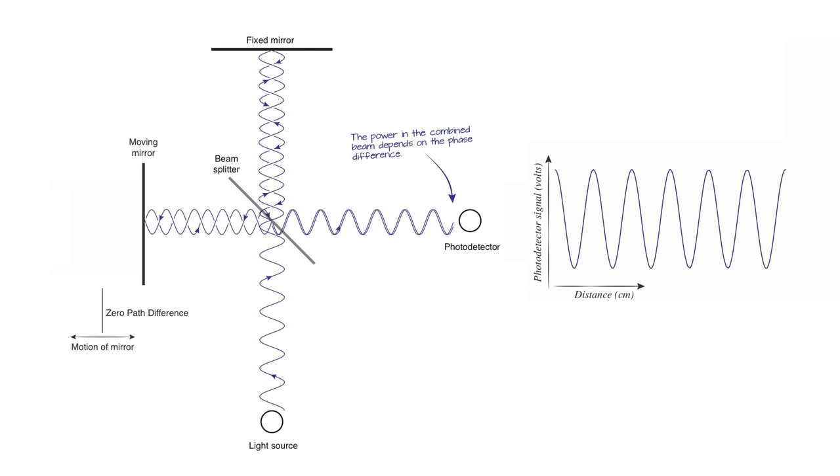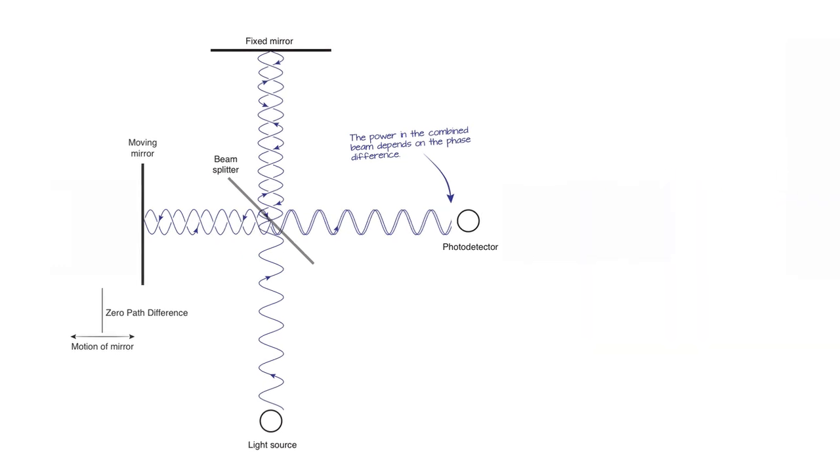And of course, if you know the speed of light, then suddenly astronomy can be used to very precisely measure distances to objects. I mean, really, people who come up with very precise measurements really help the world do things. If you want to know how far the moon is away, to the nearest centimeter, to the nearest millimeter, you need to determine exactly what a meter is. And let me tell you, that stick in Paris is not precise enough. You need to use basically a measurement based on laser light to determine what the meter is, and that's what it's been redefined as. All right, so there's our interferometer.